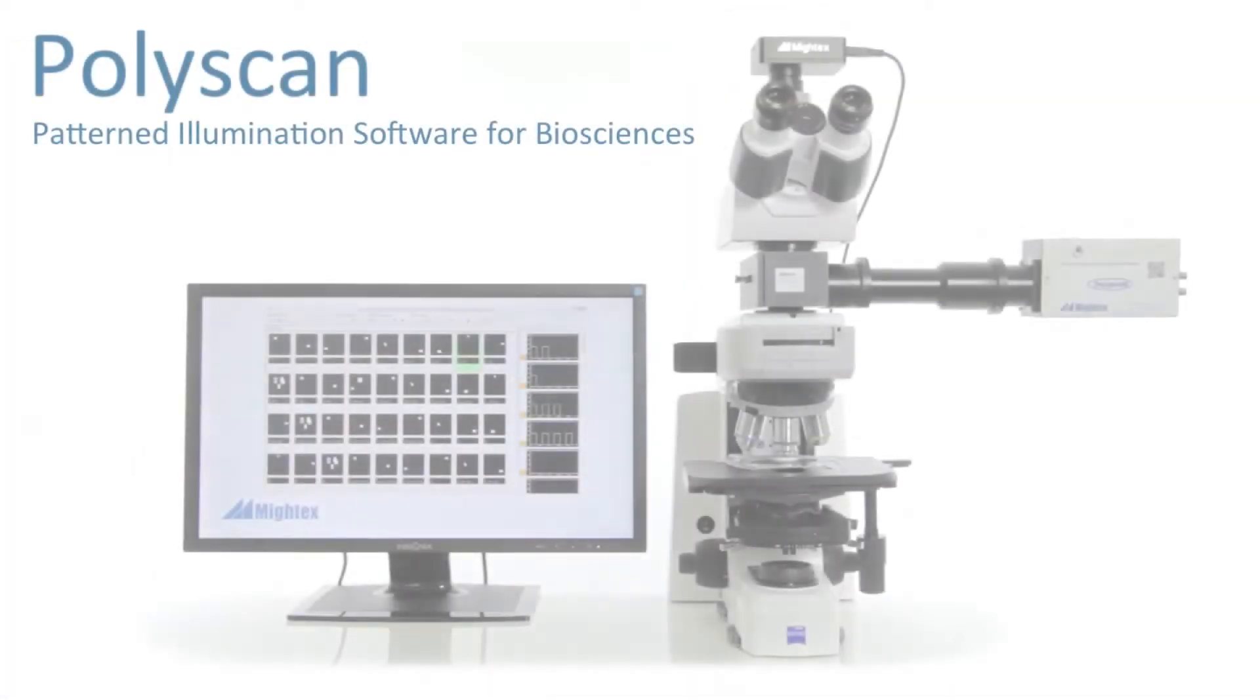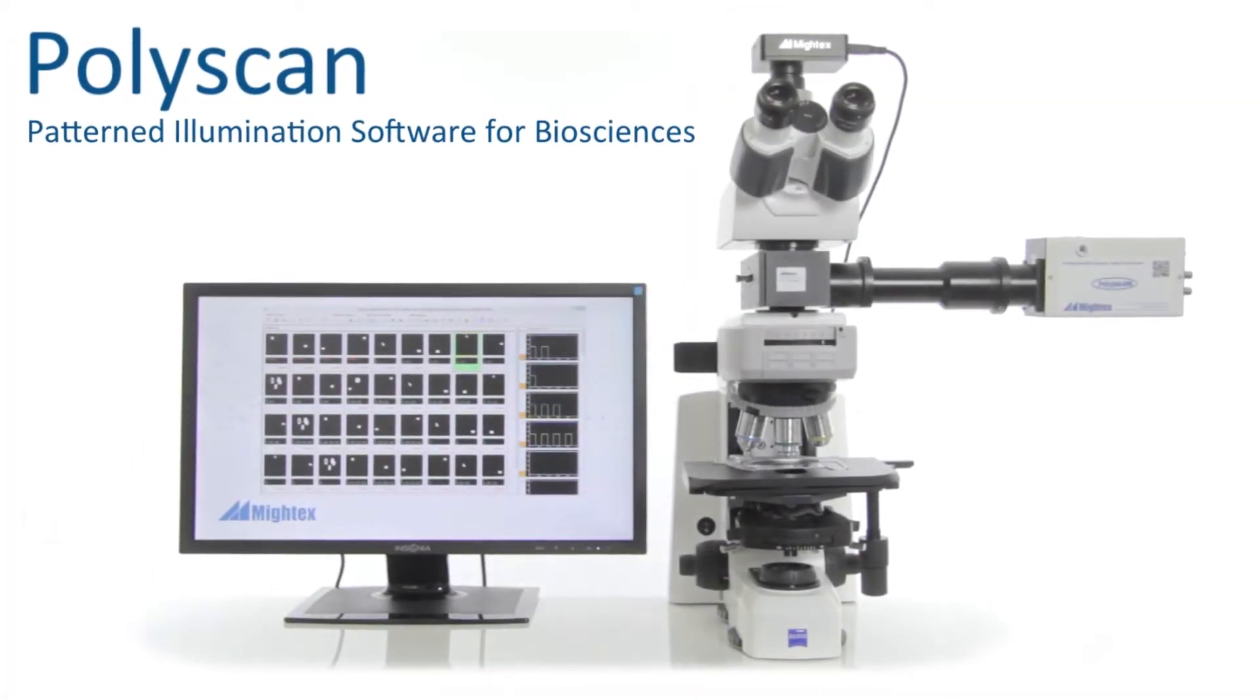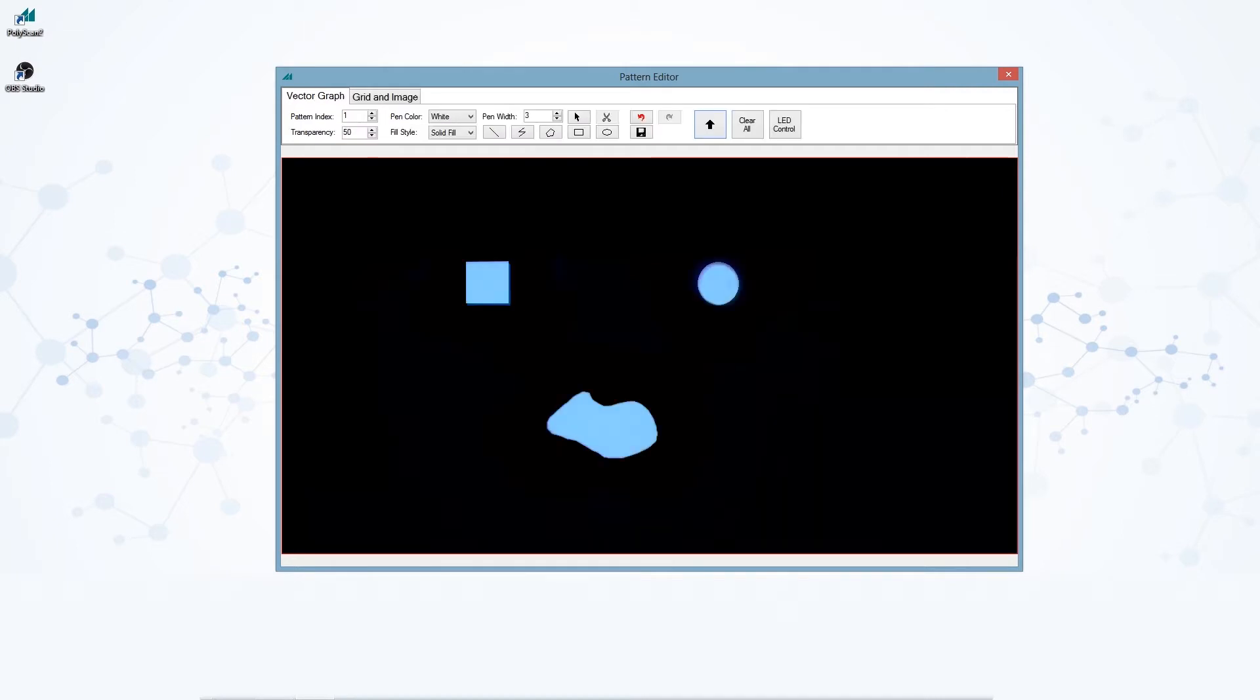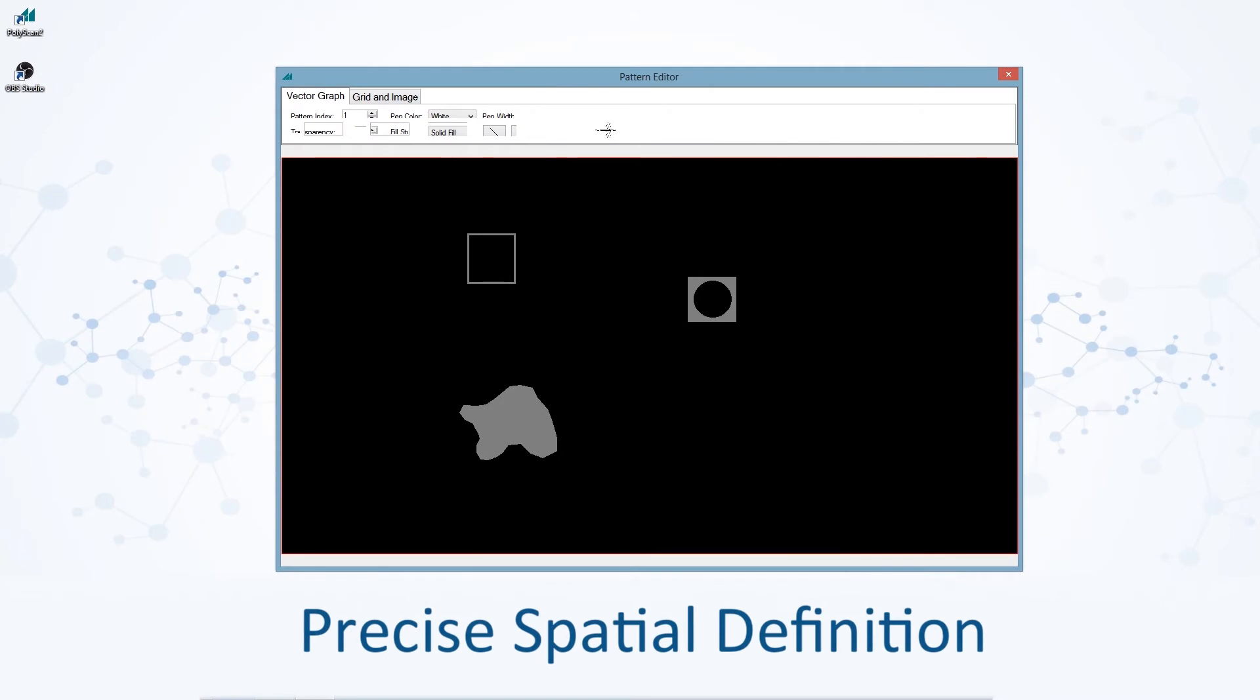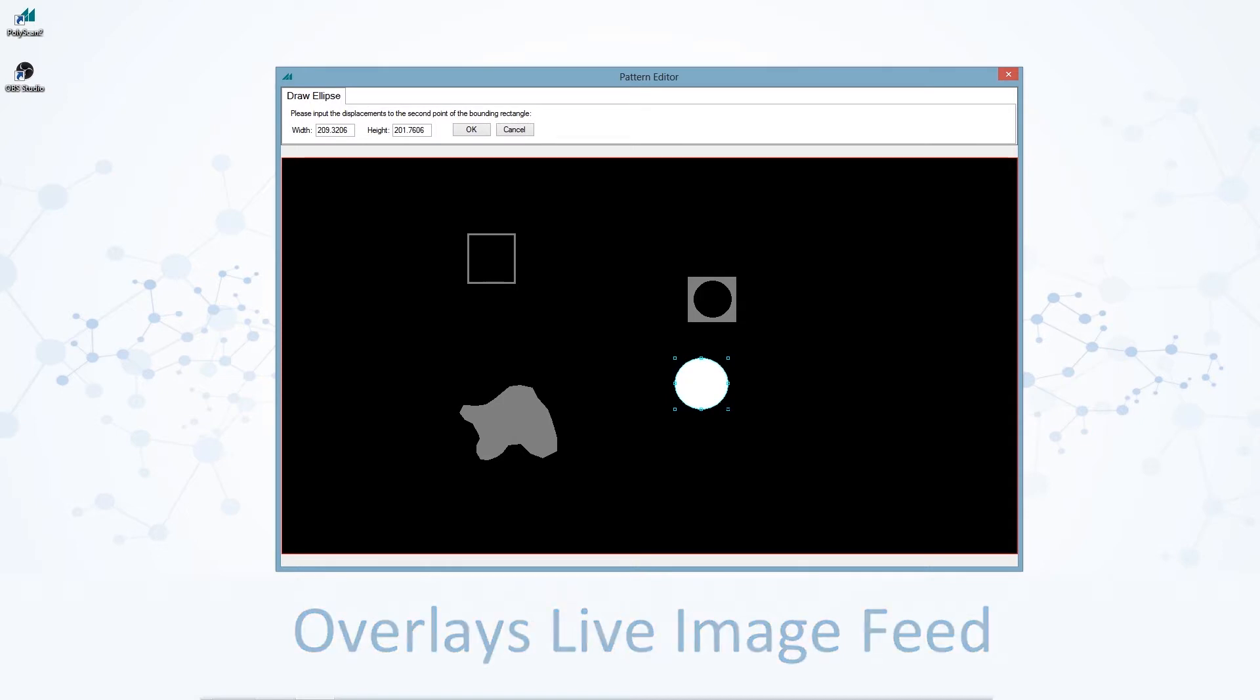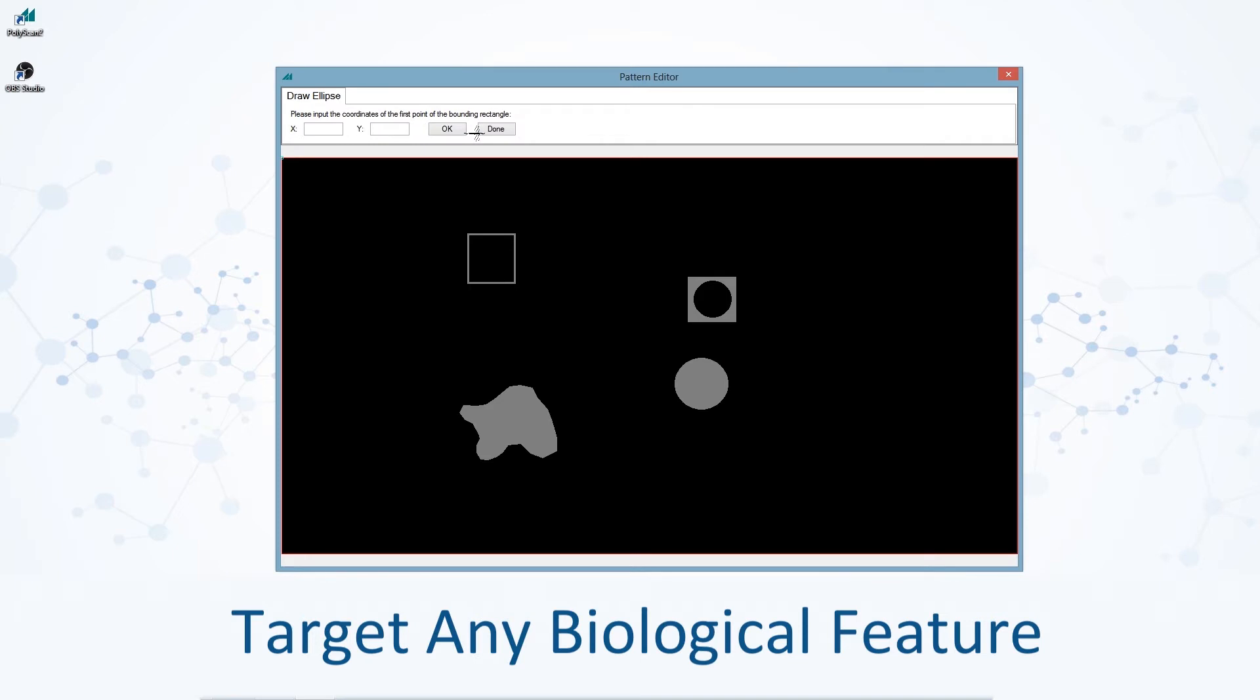This is where PolyScan comes in. At the heart of the PolyScan platform is a sophisticated yet easy to use user interface that allows users to define any 2D spatial pattern of light. The drawing board is overlaid on the viewing screen of the camera to allow researchers to view and identify their target and precisely define illumination patterns that accurately match the shape of the biological feature they wish to target.